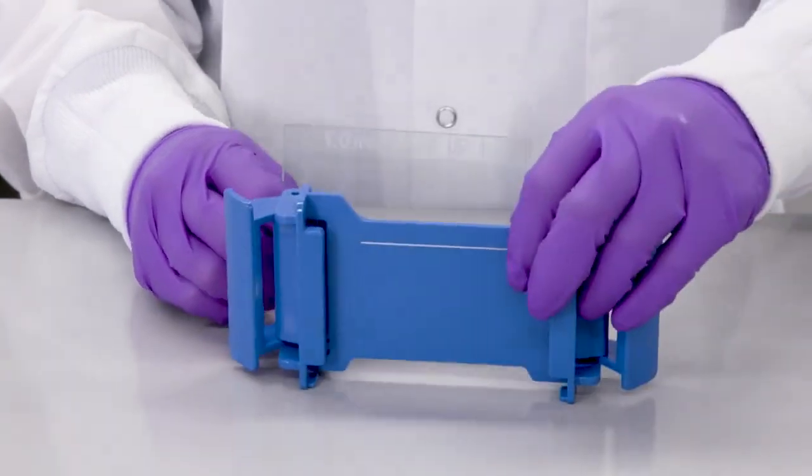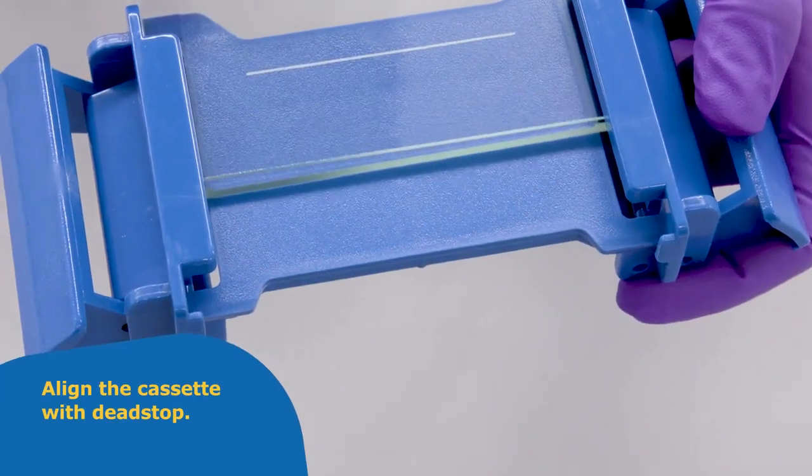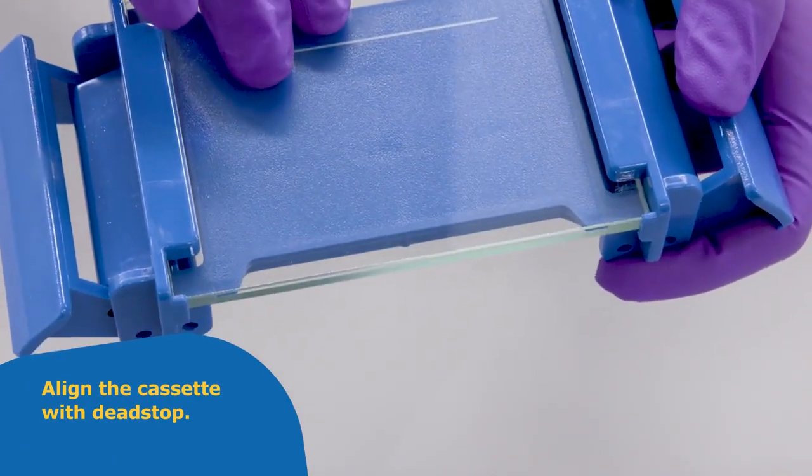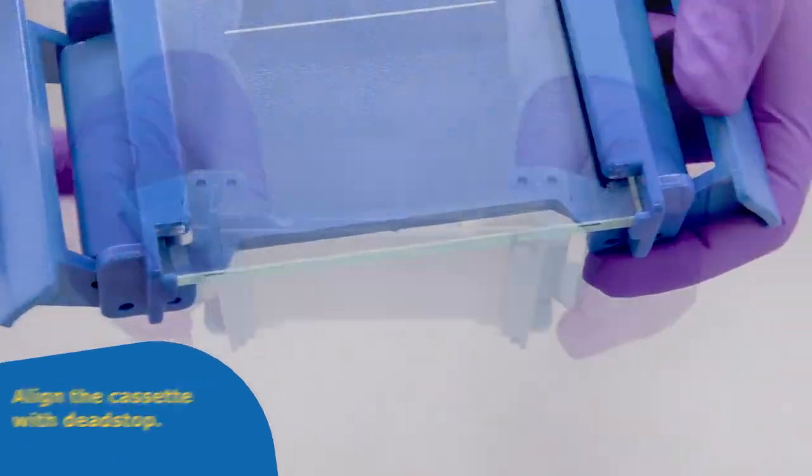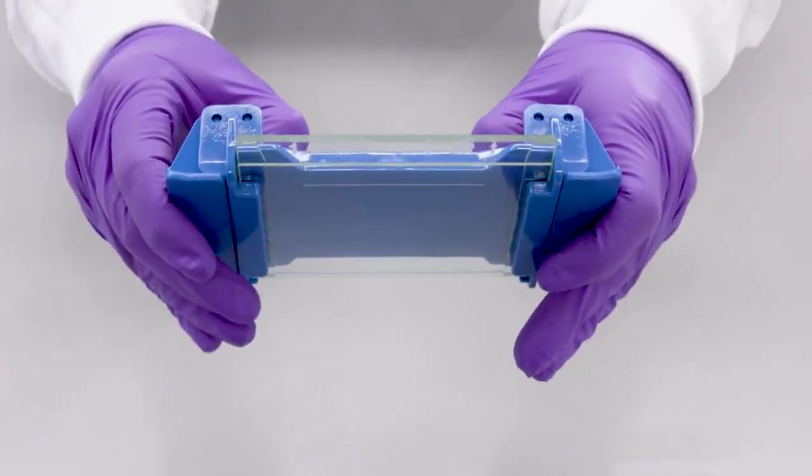With the side clamps open, slide the cassette into the caster frame until it is aligned on the dead stops located on the bottom of the frame. Secure the glass cassette by swinging the side clamps inward.